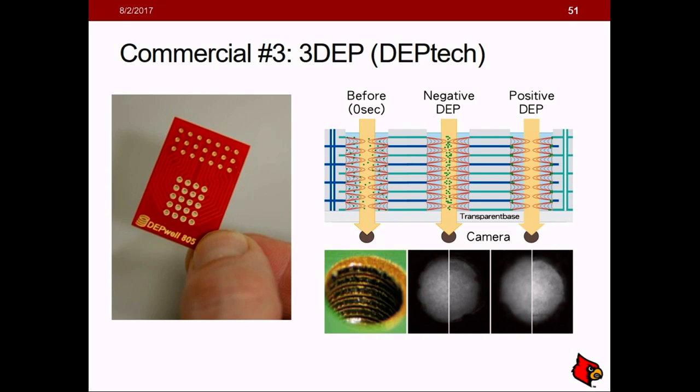A third one, called 3DEP, has 20 wells with 20 different frequencies applied.